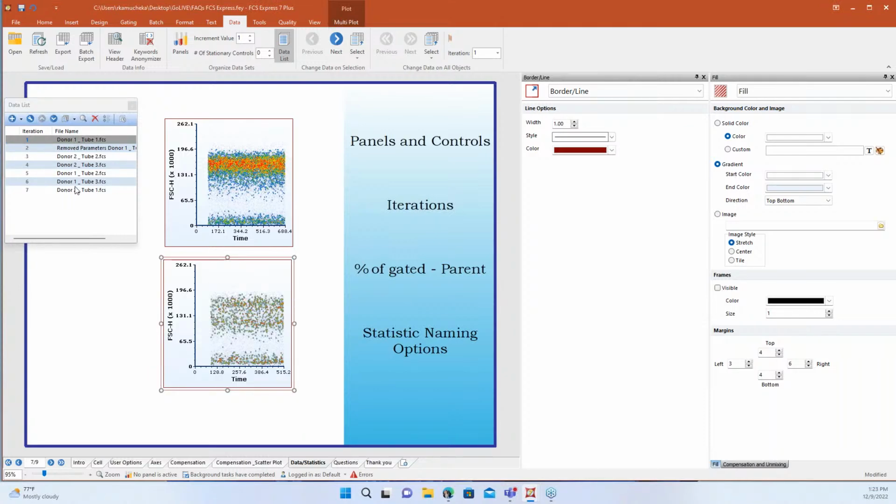What has happened here is FCS Express will try to remember the order in which you're using your data set. So if I use sample 1 and 3 or sample 1 and 4 while I'm working through my analysis, it will try to keep that pattern. If I did 1 and 4, it would be 2 and 5, 3 and 6, 4 and 7. And then when I got to sample 5, there was no 8, so it would break the pattern, and anything from 5 on would be grayed out. Right now, because I did the whole spread of data, you see that 2 through 7 is deactivated pretty much. And you won't be able to do batch processing or let the software do that.